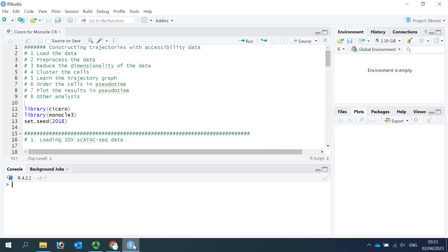Hello everyone, welcome to my video tutorial for single-cell RNA and DNA data analysis. Today I'm going to show you how to perform trajectory analysis for single-cell ATAC-seq data.